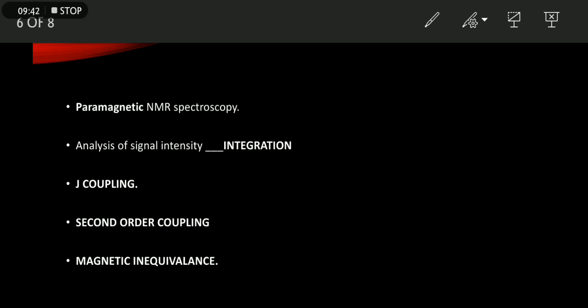And the last point is about the chemical shifts and magnetic inequivalence. More subtle effects can occur if chemically equivalent spins, having the same NMR shift by symmetry, have different coupling relationships to the external spins.